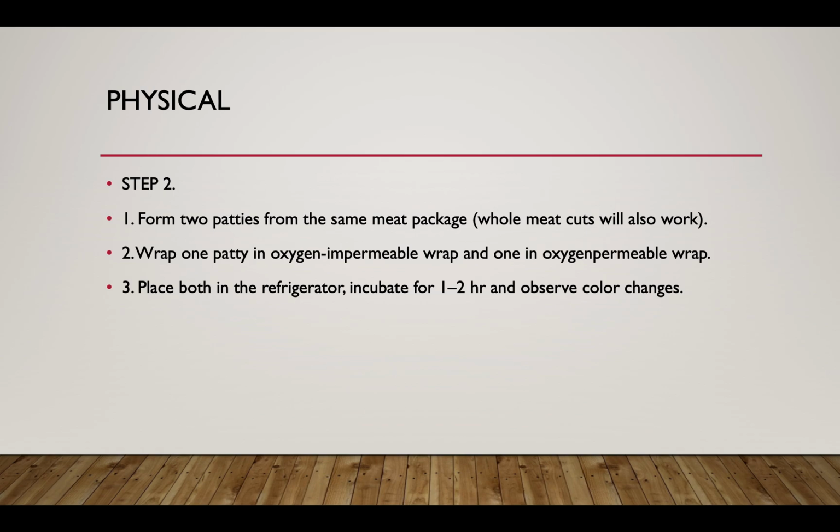In stage 2, we will form 2 patties from the same meat package. Wrap one patty in oxygen impermeable wrap and the other in oxygen permeable wrap and place both of them for 1 to 2 hours in refrigerator, and after that we will observe the color changes.